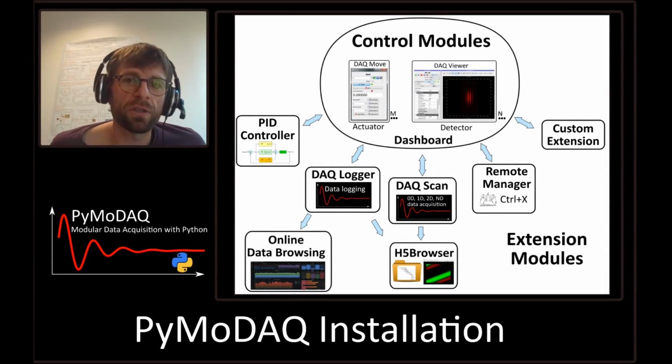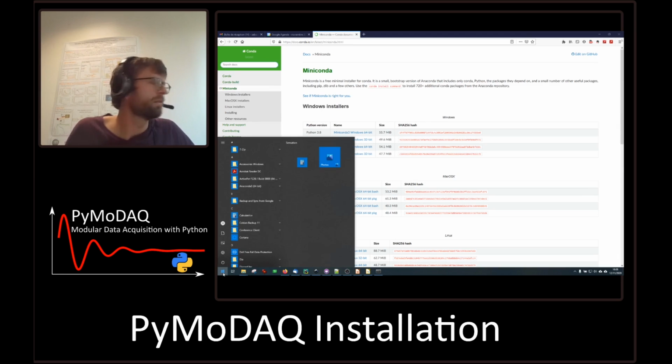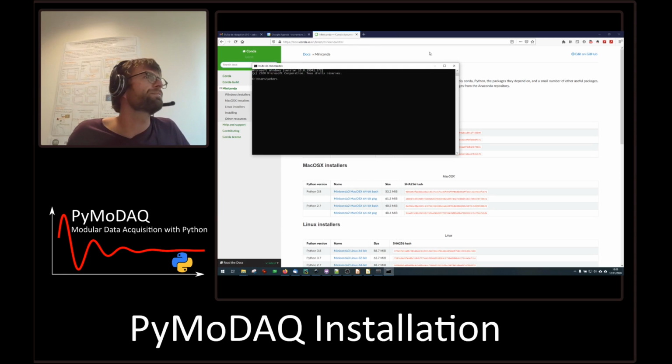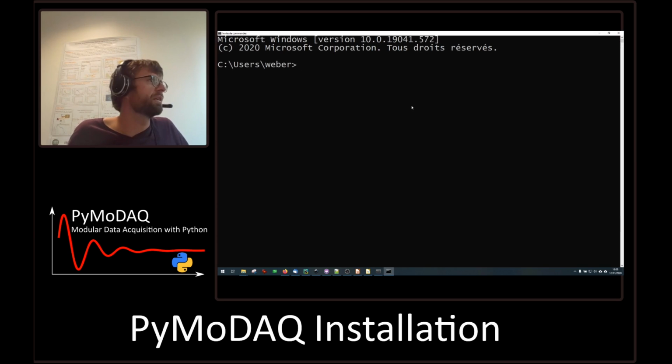All right, just a precision, if you don't find the specific Anaconda or Miniconda command prompt, you can start from just a usual one, and I'll show you how to get and activate your environment. So I'm going to go back to the screen view, and in the start of Windows here, I'm going to call a command line, just a regular one. And I'm increasing a bit the size so you can really see it.